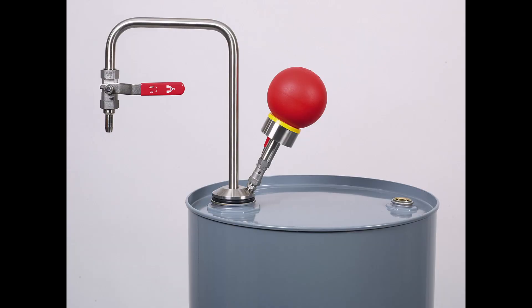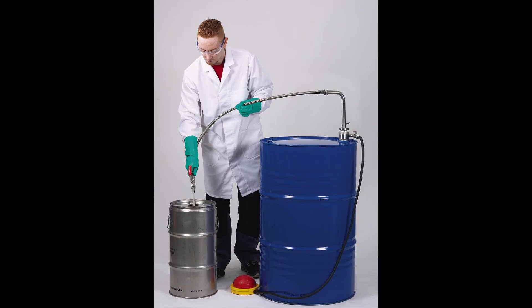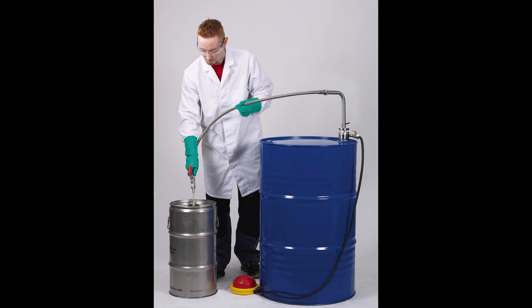You have seen the Solvent Pump Mini and now I show you the taller versions which work and are used the same way. That is the solvent pump hand operator for containers up to 60 liters. The foot operated solvent pump is suitable for containers up to 220 liters. The withdrawal system for solvents is available for UN containers with a test pressure of at least 250 kPa, for containers of 60 or 220 liters.